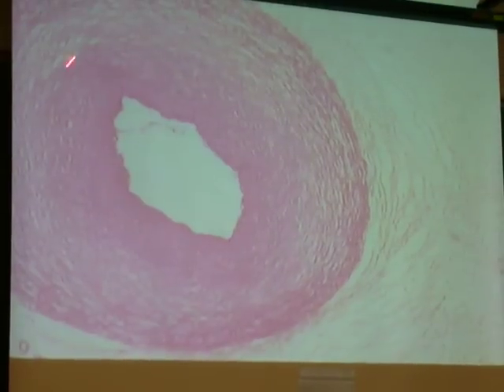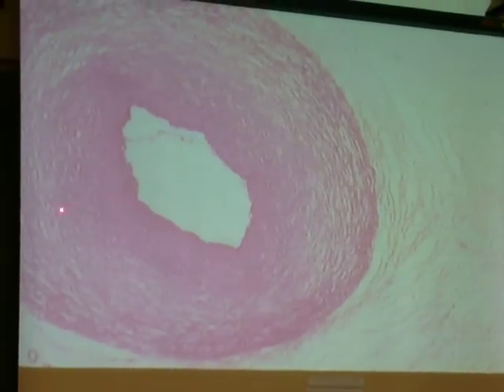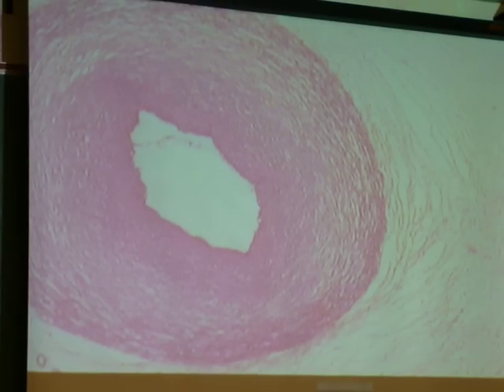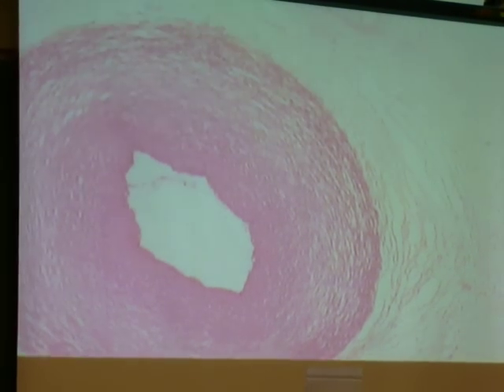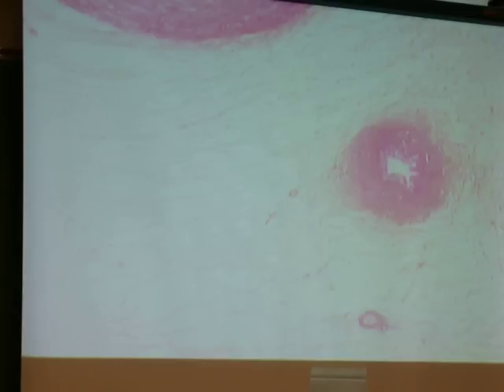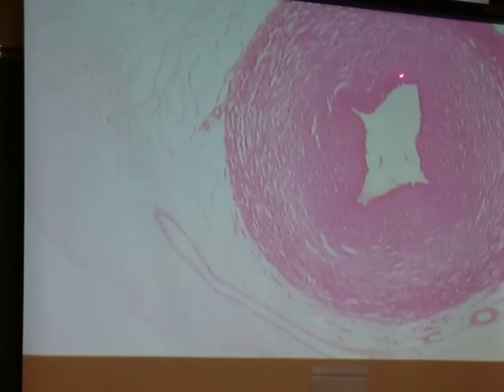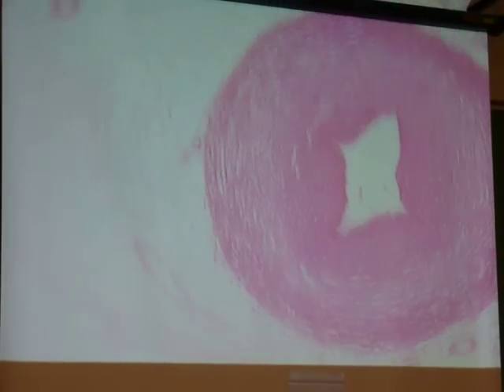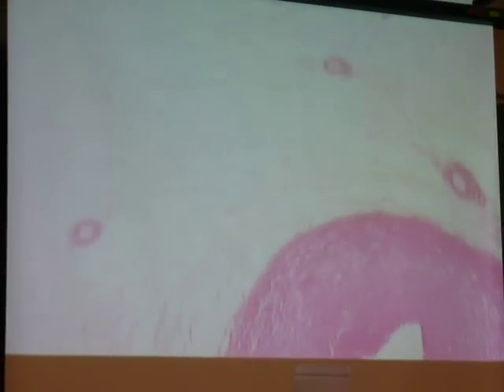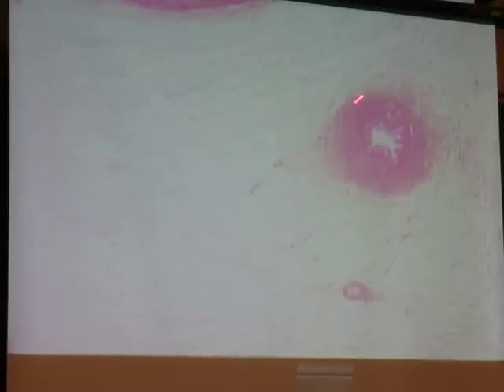So this is one artery here, really thick tunica media. And then you scroll down here, here's another artery. Usually right between the arteries is that allantoic remnant, that duct there, which we don't have to identify.